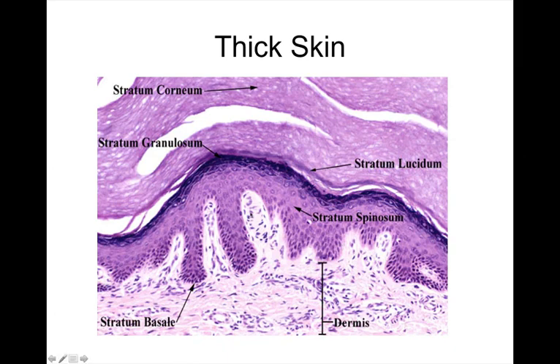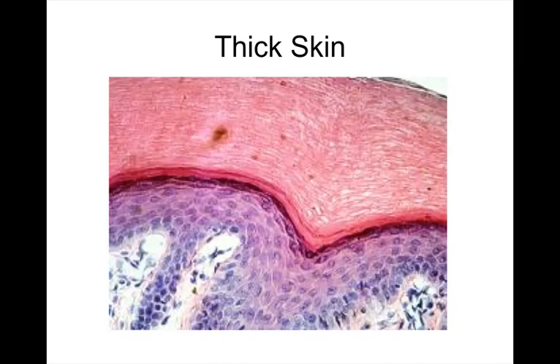What do we call this part that kind of pokes up into the epidermis? So the papillary layer that shows the dermal ridges. Yep. So there's papillary layer, and actually, just deep to that, I'd say even from here to the bottom of the slide, that would be where the reticular layer starts. And you can see that pinkish, those are all collagen fibers that are dense, irregular fibrous connective tissue. Yeah, you can see that there's no orientation down there. It's kind of going every which way. Yep, more like swirly. Good. Nothing to do with thick skin. Interesting.